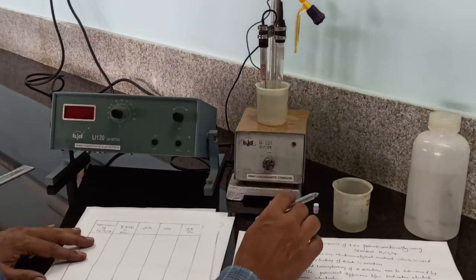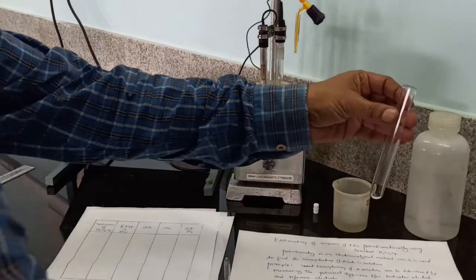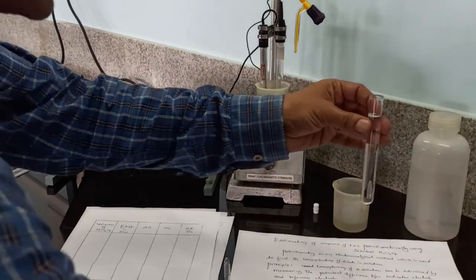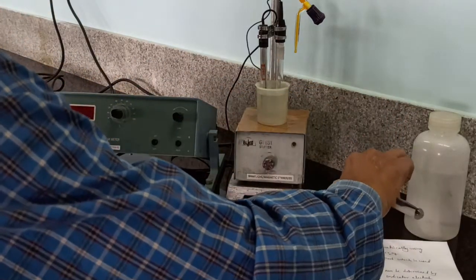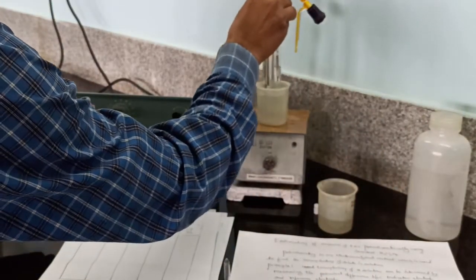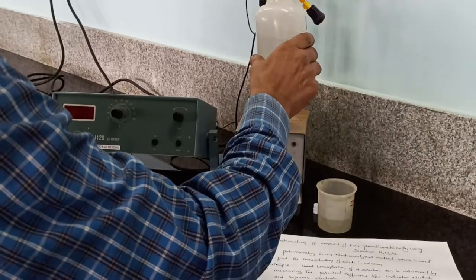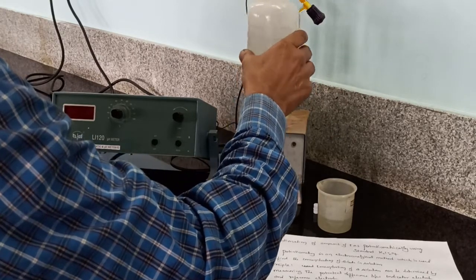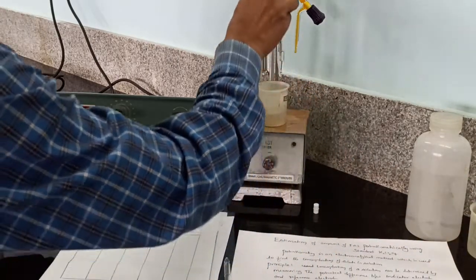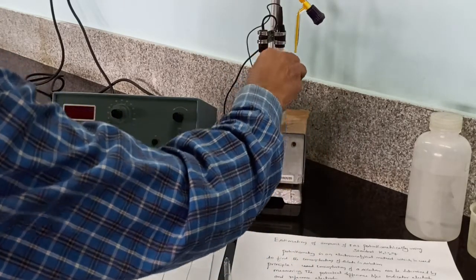We will provide FAS in a 100 ml beaker, add 1 test tube full of sulfuric acid to maintain acidic medium, since potassium dichromate acts as a strong oxidizing agent in acidic medium. Wash these electrodes, this is platinum electrode and this is calomel electrode, with distilled water, and immerse these electrodes into this FAS solution and put this magnetic paddle to stir the solution.